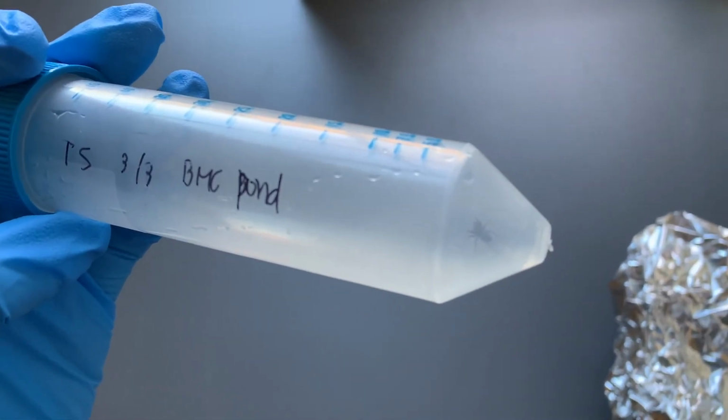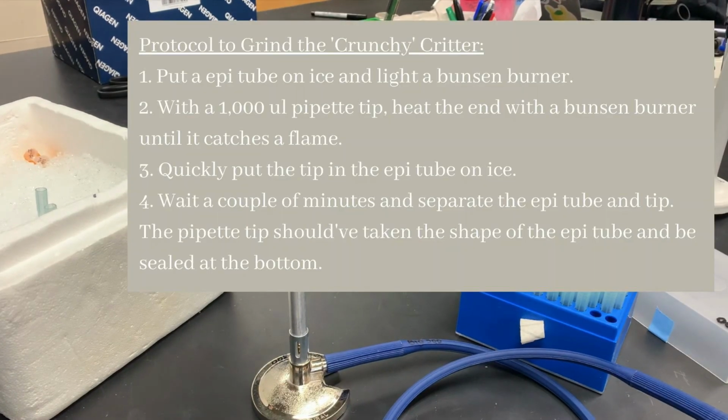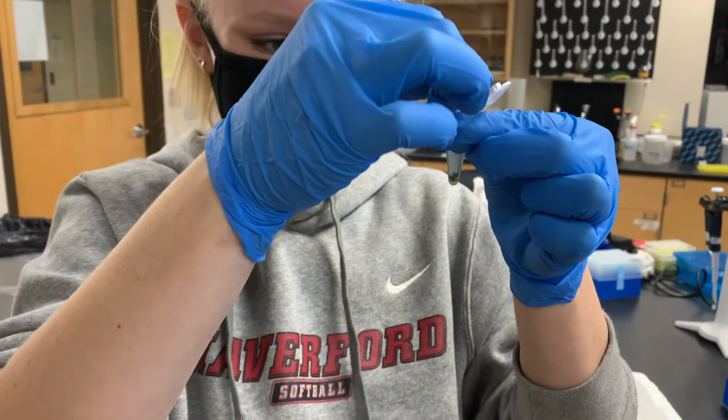One of the 2 critters I selected to target barcode was a spider I collected at the Bryn Mawr pond. I put the spider in an epitube and, with a melted 1000 microliter pipette tip, crushed it to break open its exoskeleton. Then it was time to put my target barcoding samples in the 56-degree water bath for an hour.